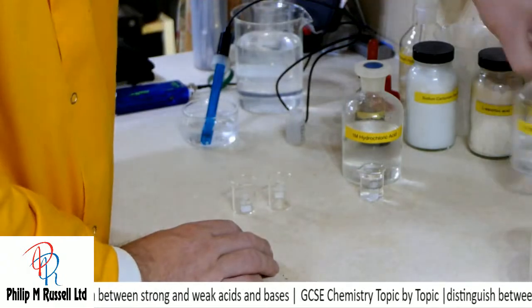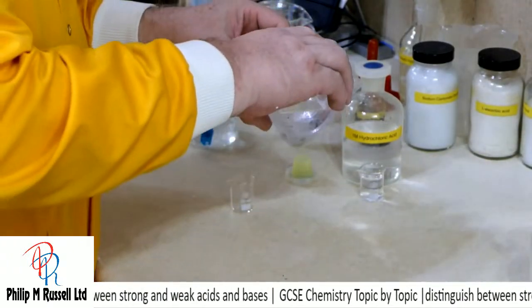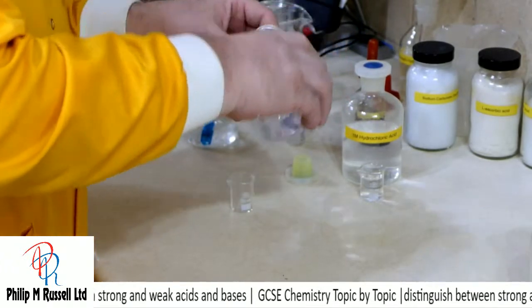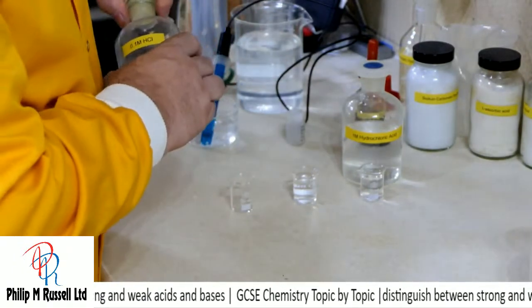I'm going to take some of my 0.1 acid and put it in there.